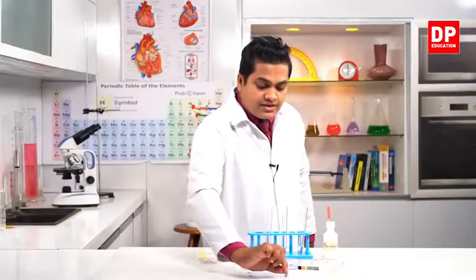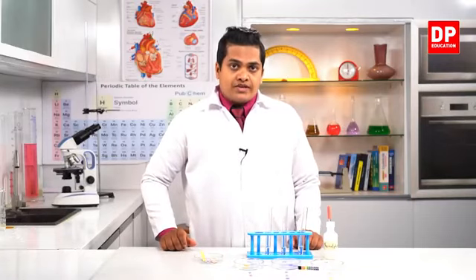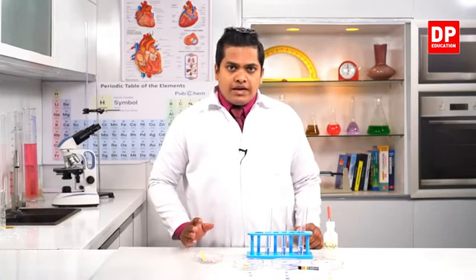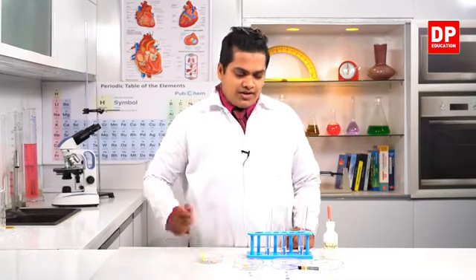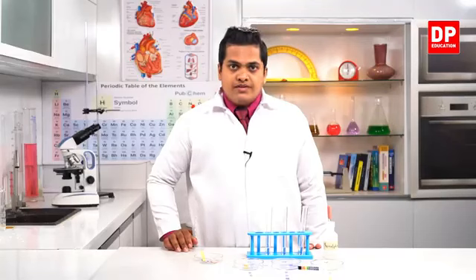So bases are showing blue related color. It's quite easy to remember. B, bases. B for blue color. See, blue color, blue related color, base.